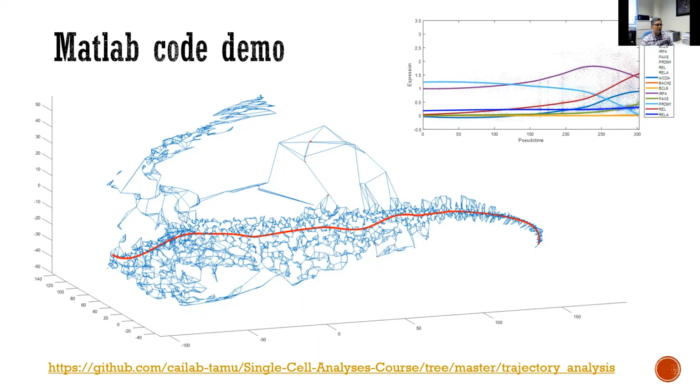I didn't show the cells with these data points here, but only show the framework of this KNN network. After you build this, you can start from one starting point cell to search for a path as long as possible, from one edge of the network to another.